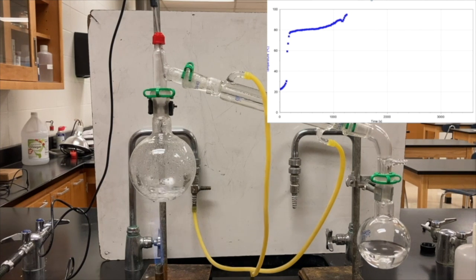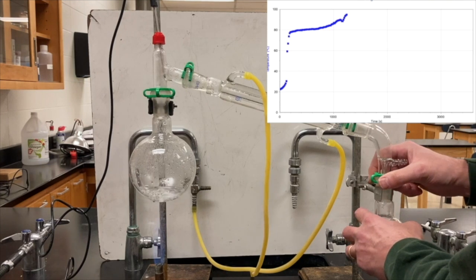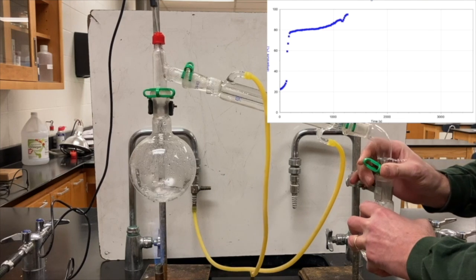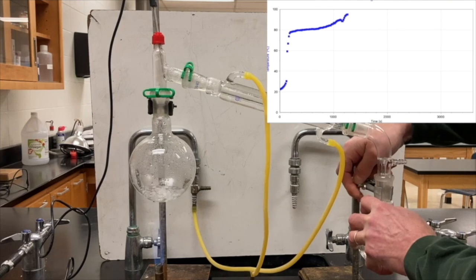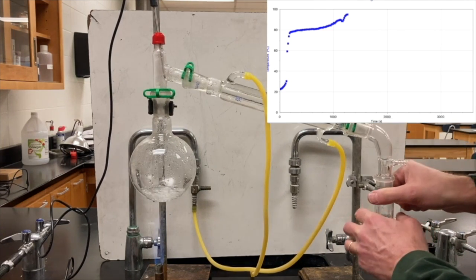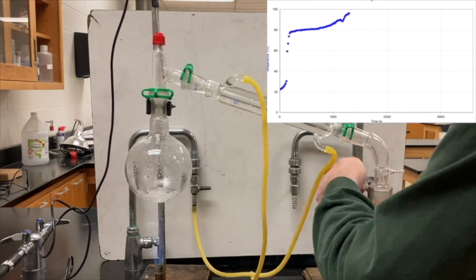Now the alcohol appears to have completely stopped boiling because the temperature is beginning to shoot up rapidly at this point. You can see that the dripping has decreased a lot in the cold end. So I'm going to take this opportunity to disconnect the cold end flask, because I think the next thing that will happen is I'll begin to have water condense in my condenser tube, and I'm trying to accomplish a separation of this mixture, and that would sort of defeat the purpose.